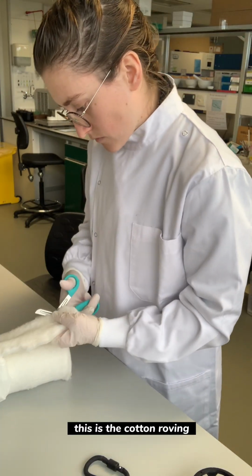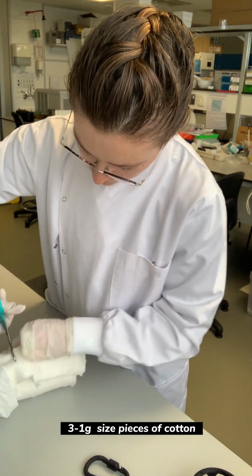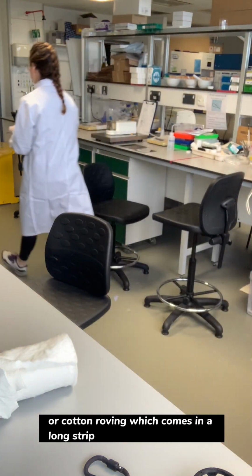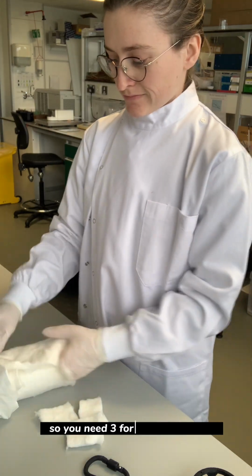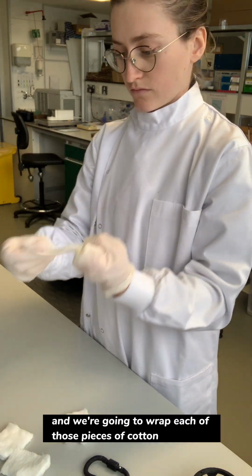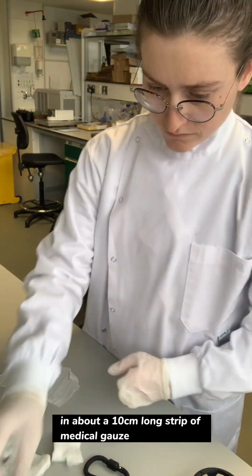This is the cotton roving, and you're going to want to cut 3 1-gram size pieces of cotton. You can either use a cotton sheet like this or cotton roving, which comes in like a long strip. There I've got my 1-gram pieces, 3 in total. So you need 3 for each Metaprobe. And we're going to wrap each of those pieces of cotton in about a 10 centimeter long strip of medical gauze.